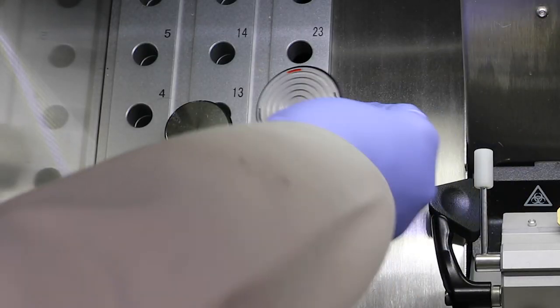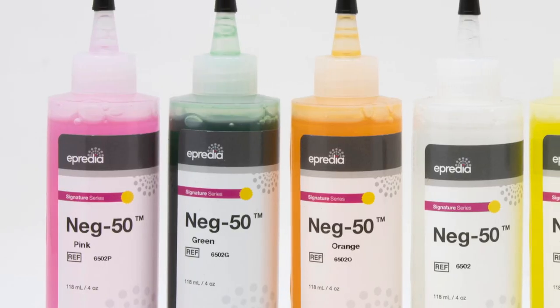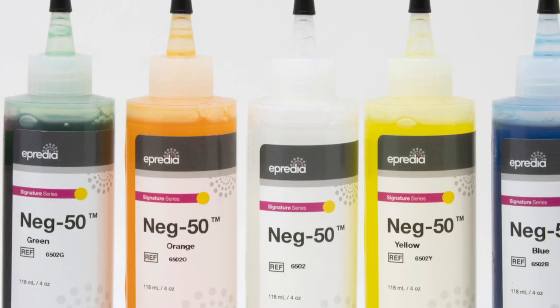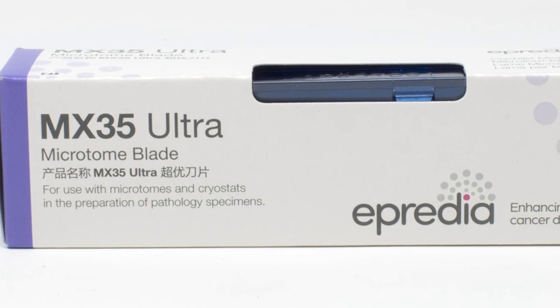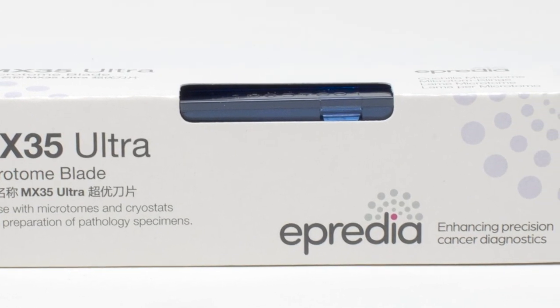Apredia offers the complete solution for lab sectioning samples, including specimen stages and frozen section media in a range of different colours to help with sample tracking. Apredia's ultra microtome blades are manufactured with proprietary pink steel hardening technology and a unique blade coating that delivers outstanding sectioning performance, durability and consistency.